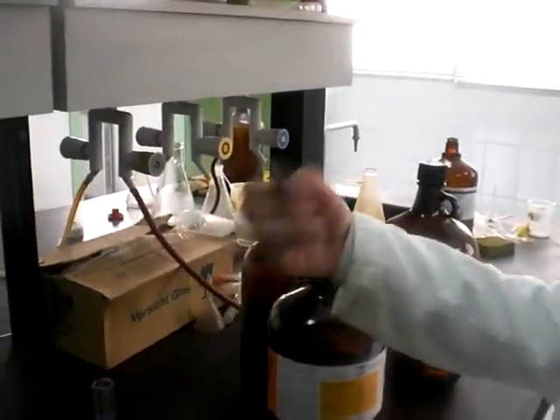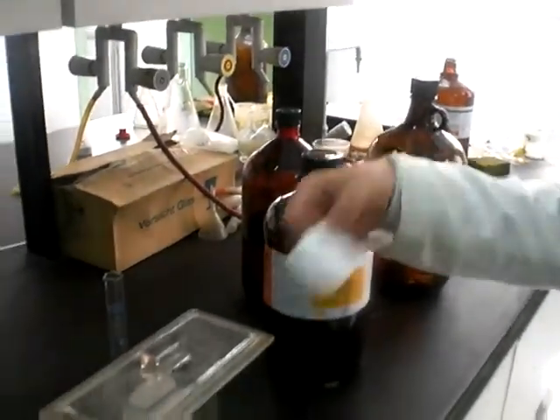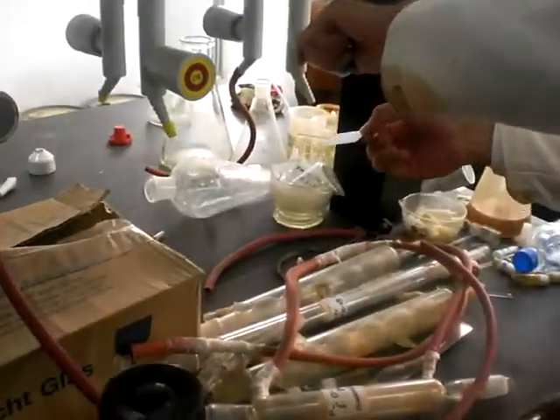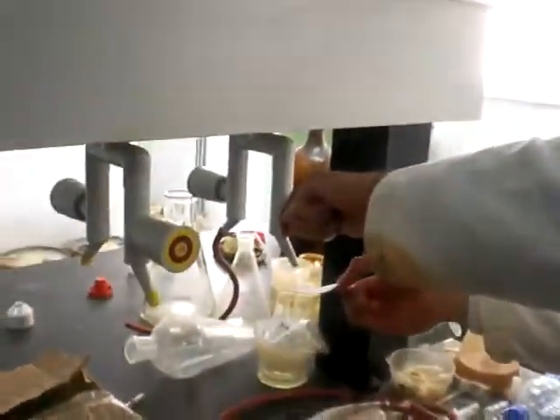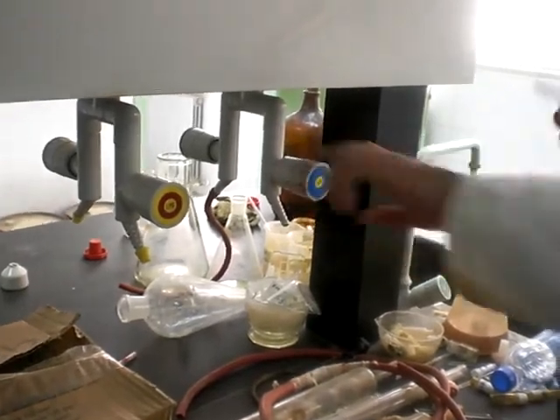We will allow the mobile phase to dry quickly, and this is a benefit of using non-polar solvents. We might use the airflow here to accelerate the evaporation rate of the mobile phase.